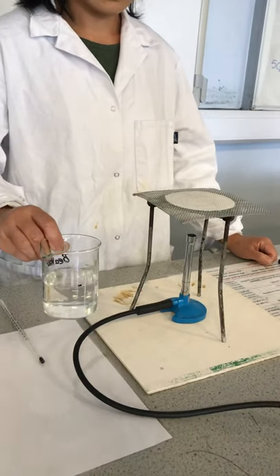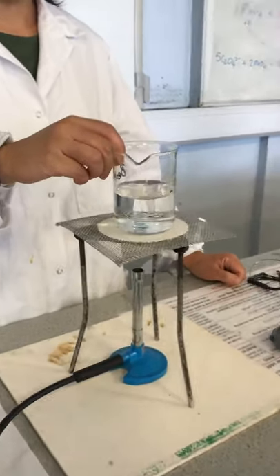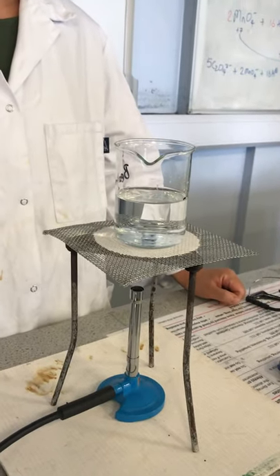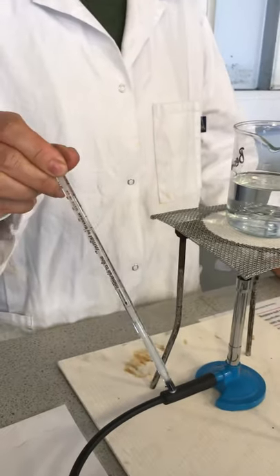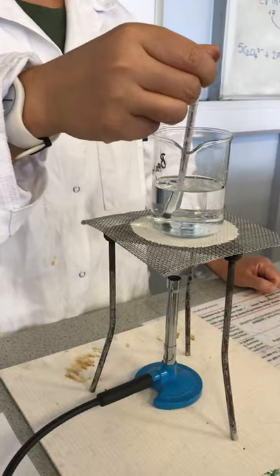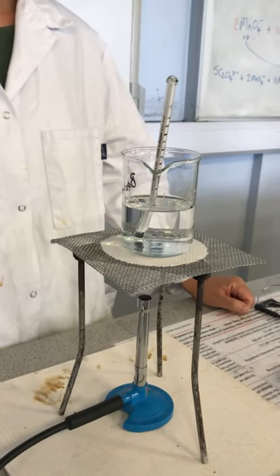Now place this beaker on top of the ceramic gauze and put an alcohol thermometer inside the beaker. Make sure the beaker is at the center of the gauze.